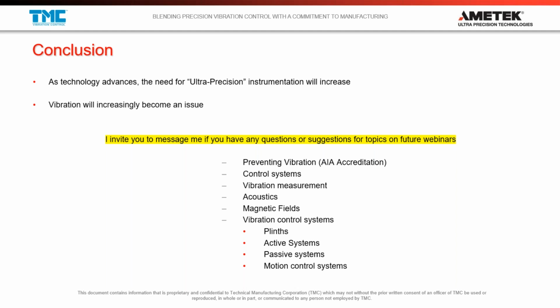So I would actually start to take a look around your facility and maybe look for things that you can hear that are introducing that vibration, because at that high frequency, it's not likely to be coming from the floor. I think you're seeing an acoustic effect. Good question.